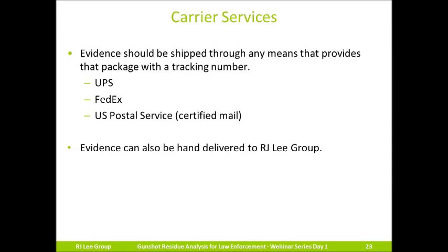Evidence can be shipped through any means that provides that package with a tracking number, such as UPS, FedEx, U.S. Postal Service, certified mail. Evidence can also be hand-delivered to our RJ Lee group. We have a lot of local agencies that just come on and drop their evidence off for us, and we'll have chain of custodies ready when you arrive, and we can accept your evidence at that time.